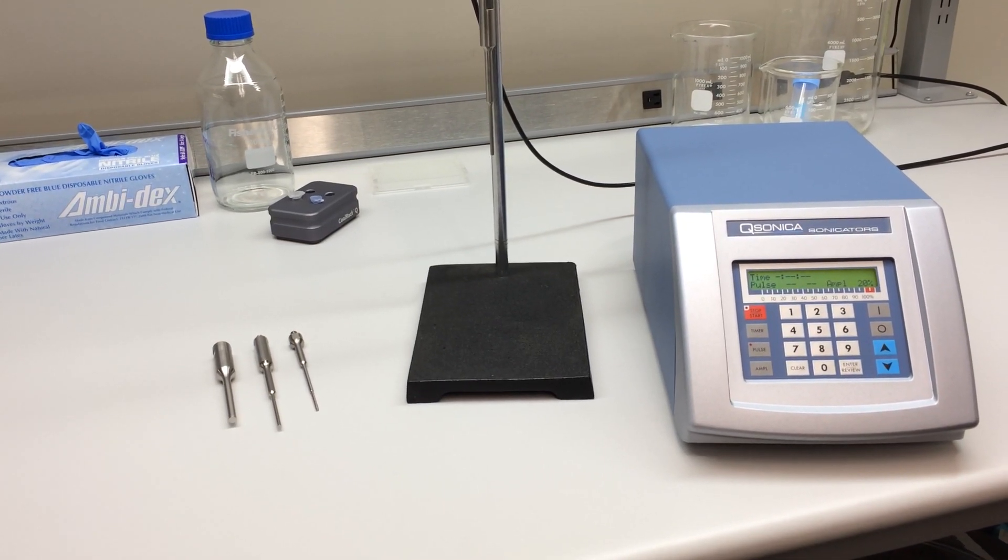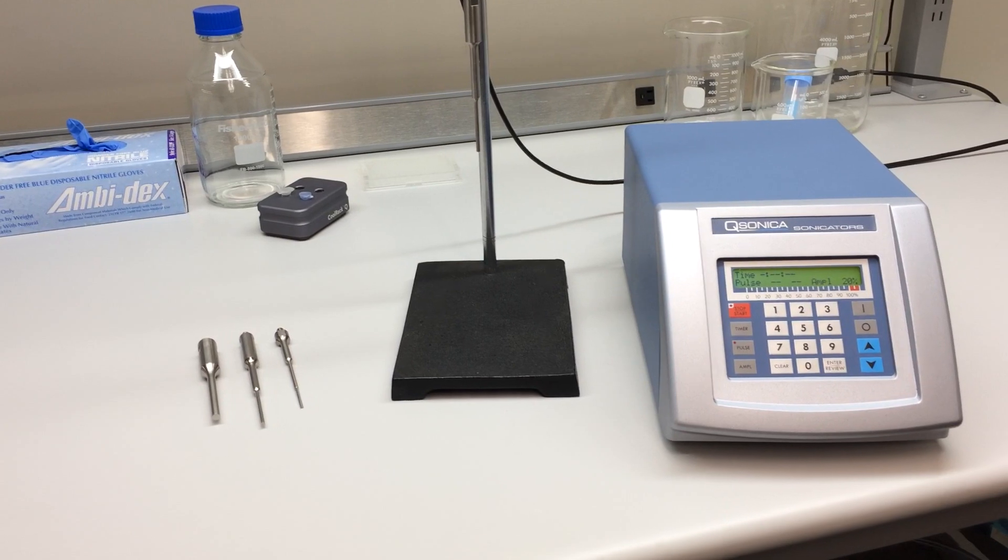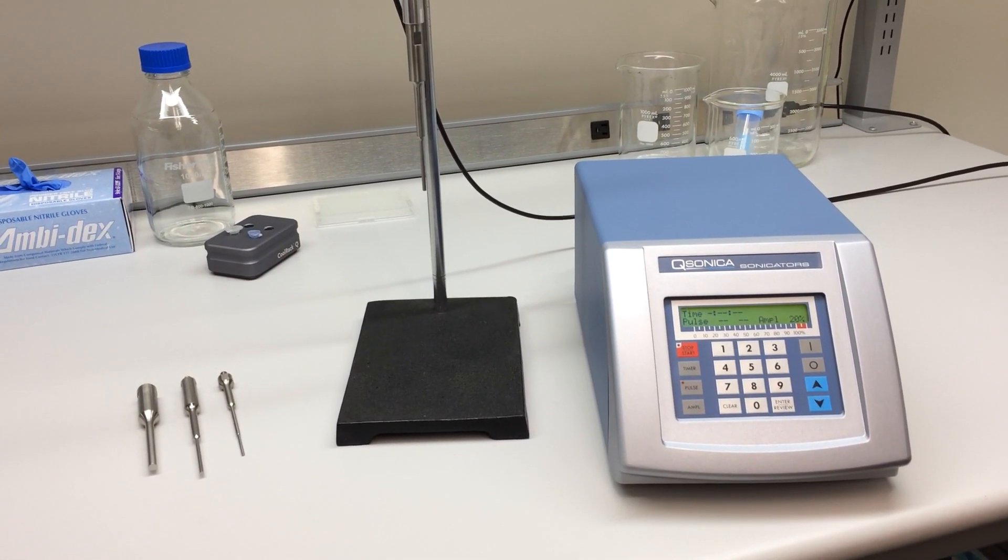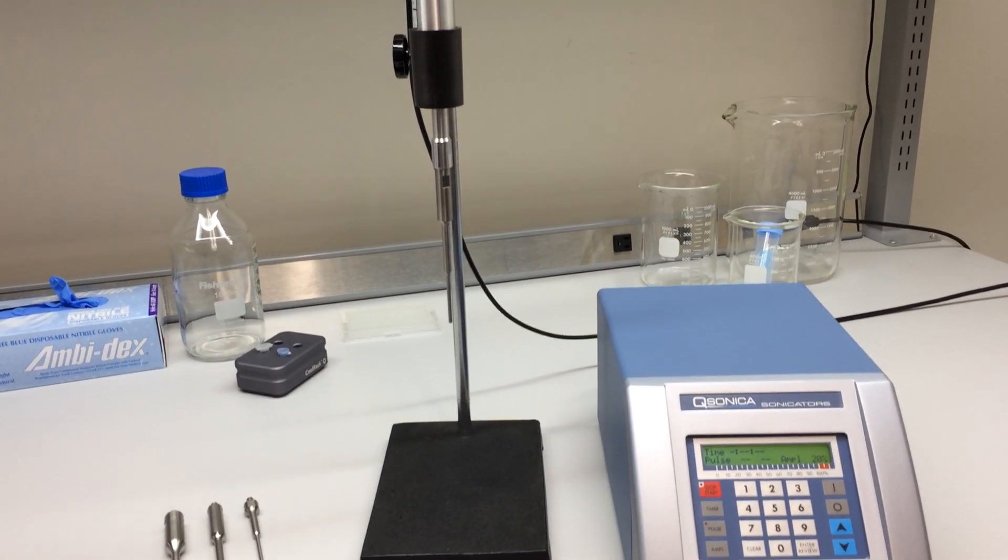The Q125 is a microprocessor-based programmable ultrasonic processor. This unit is popular for basic cell disruption, DNA and chromatin shearing, homogenization, and many other applications.